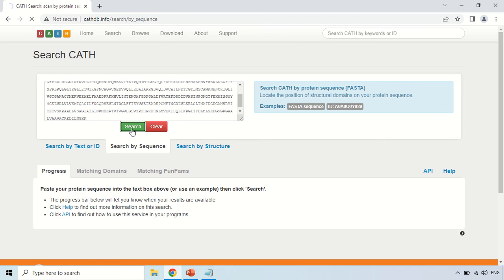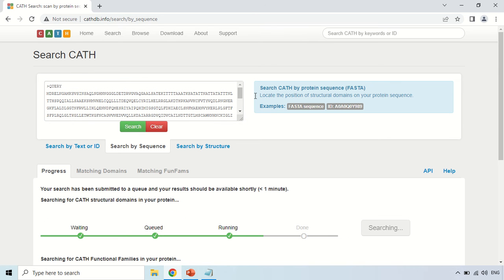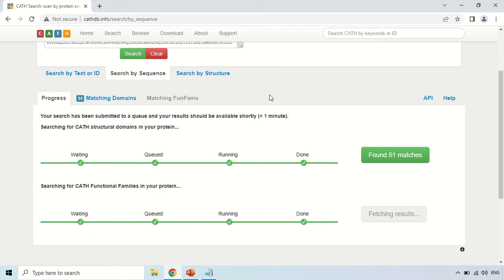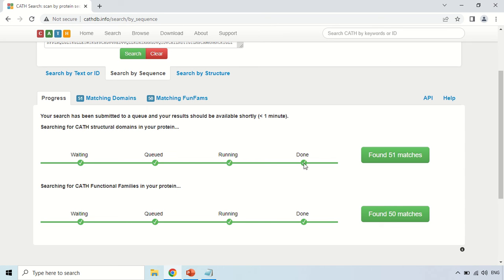Just for demo purposes, I have already downloaded a protein sequence. Copy your protein sequence and paste it into the search box, then click the Search option. As you click, the database will take some time to construct the results. You can see the progress of your query: waiting, queued, running, and done. Once 'done' is checked, it means the results are ready. Generally it takes less than one minute.